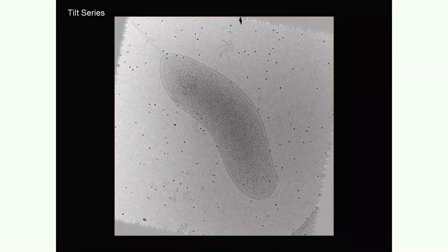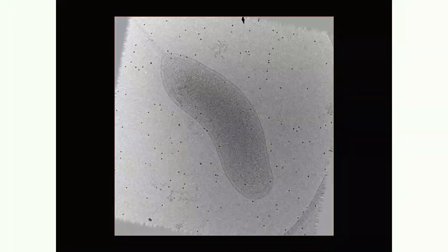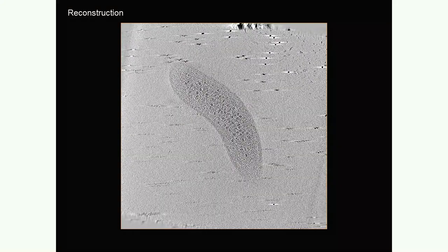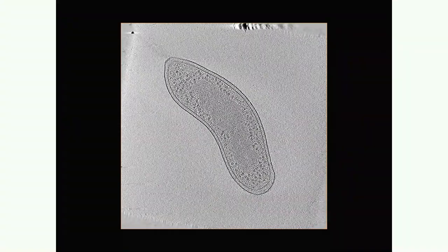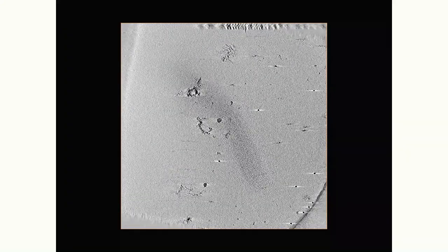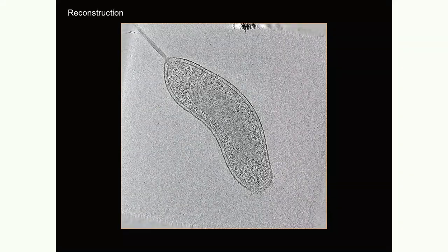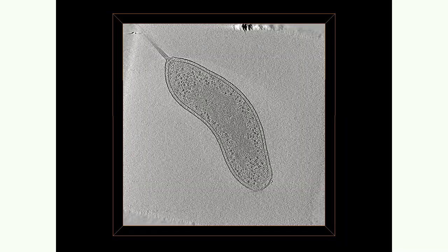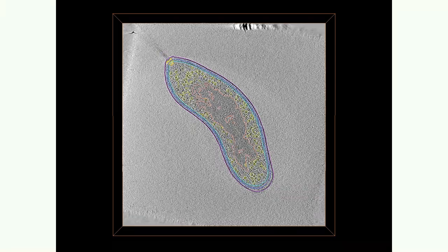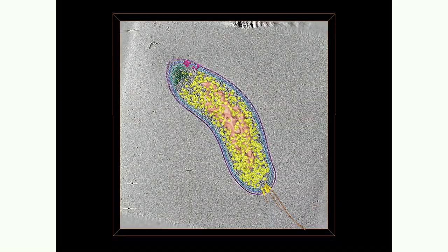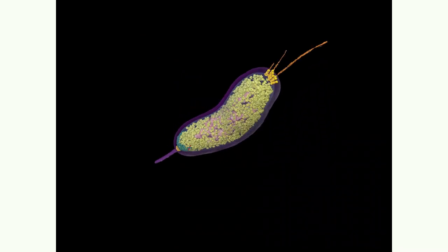This is real data from a Bdello-Vibrio cell — several different tilt series. Using computer programs, we calculate what we call a reconstruction: a 3D reconstruction of the Bdello-Vibrio cell. The sheer amount of information in each one of these datasets is absurd. You have the outer membrane, the inner membrane, the cell wall, the nucleoid, ribosomes, flagellar motor, type 4 secretion, type 4 pili, chemoreceptors, and many other organelles — all in the same cell — while only using a few pixels of it. You can literally make an entire 3D visualization of this cell.